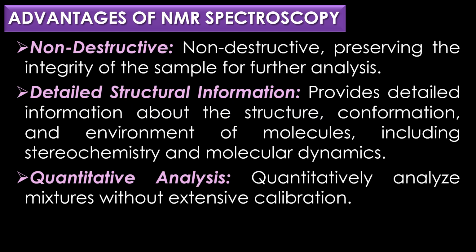Advantages of NMR spectroscopy. The first advantage is non-destructive. NMR spectroscopy is non-destructive, preserving the integrity of the sample for further analysis. The second advantage is detailed structure information. NMR spectroscopy provides detailed information about the structure, conformation, and environment of molecules, including stereochemistry and molecular dynamics.